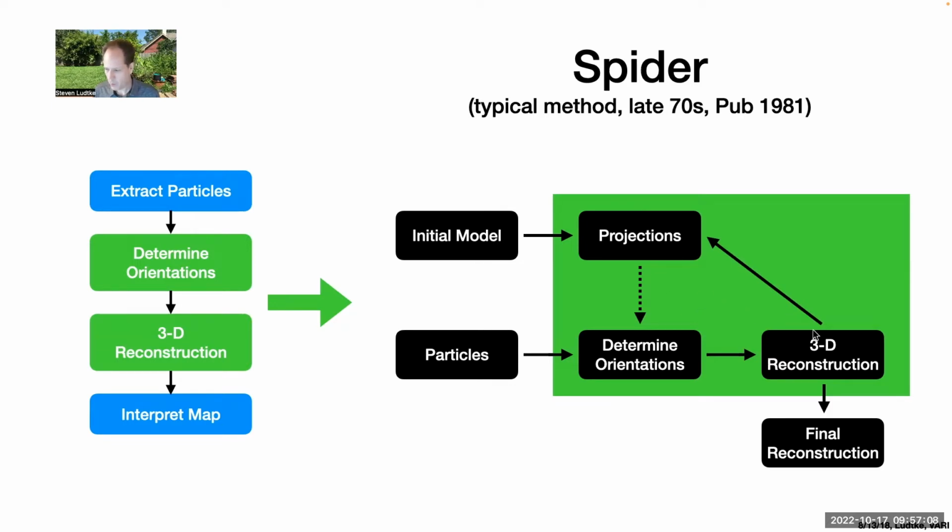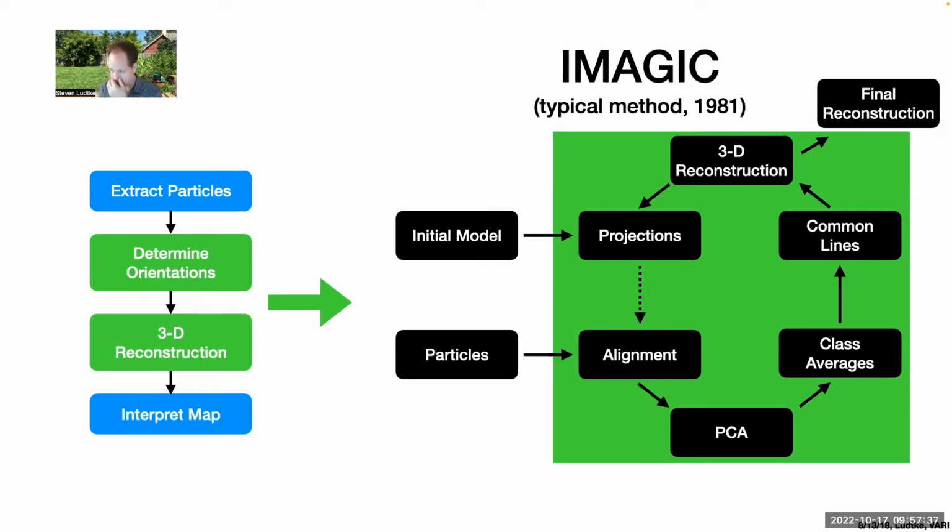The nice thing about iterative solutions is, generally speaking, either they will converge to the correct answer, or they will converge to an incorrect answer, or diverge. So you're not going to wind up in a solution where you just keep iterating forever and you're not going to get an answer out. You're going to get some sort of an answer out. The only thing you have to ask is whether the answer that you get out is the correct structure or not. And there are issues related to that, which we won't really talk about today.